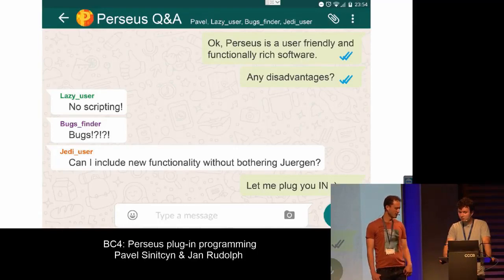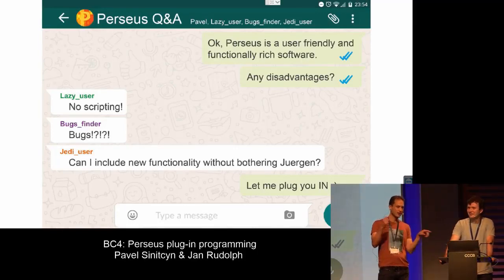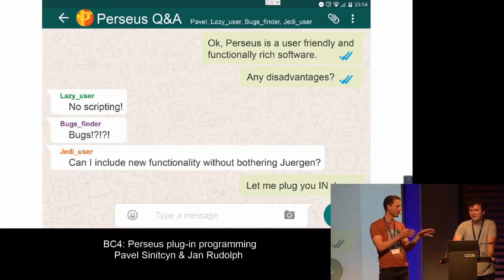So did you know that plugin? Yes. If you want to have a plugin that's actually a Python script, you need a plugin for that. So it's actually a plugin in a plugin. But in the end, everything is C# again. It's just some piping that we take over.